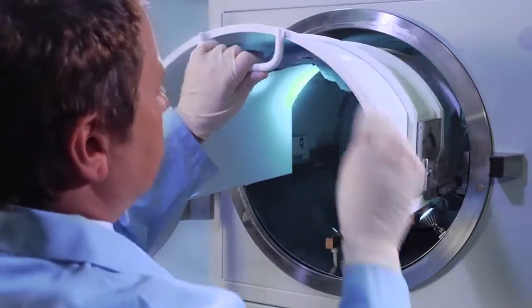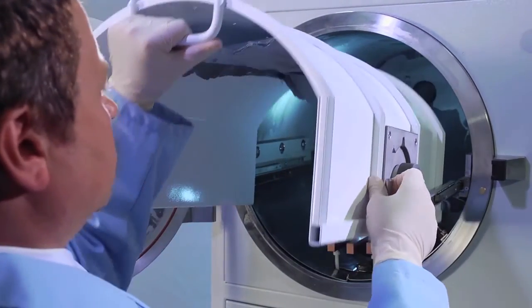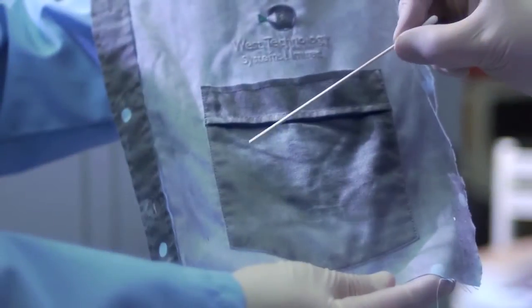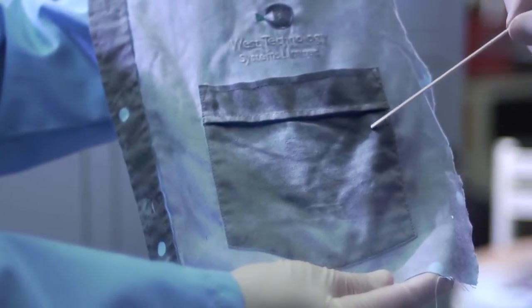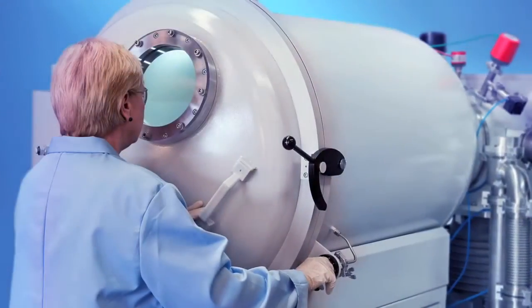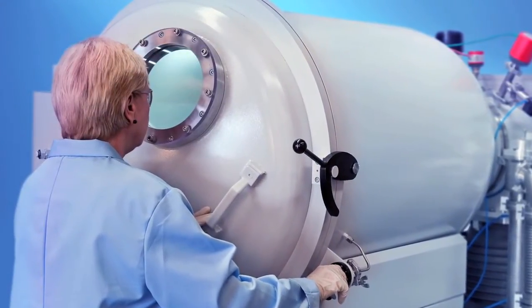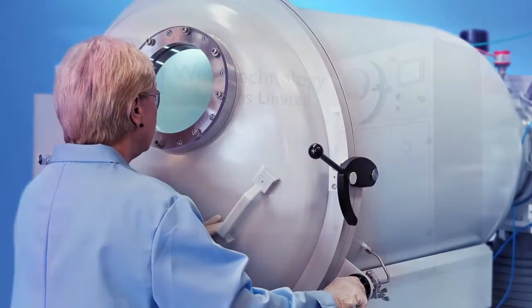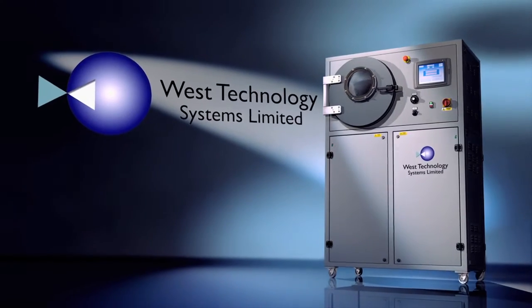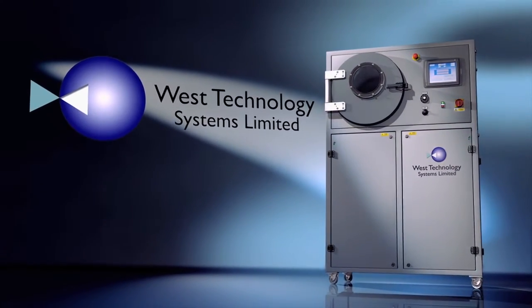Current research suggests VMD can be used to identify areas on clothing where DNA analysis can be focused, and on some fabrics it will even yield finger or palm prints. Taking onboard feedback from end users, we took a new look at the highly successful larger VMD900 and came up with a more compact unit that's easier to install and operate, all at a lower cost to our customers.